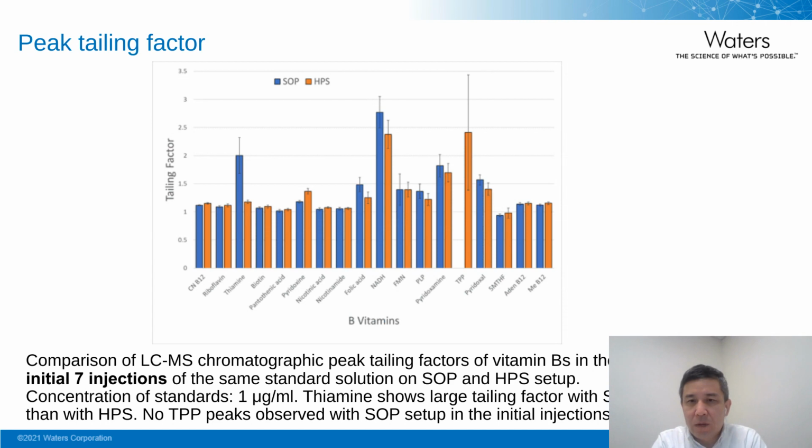Also, since for the TPP there's no peak observed with the SOP setup, there's no peak-tailing calculated for the TPP with the SOP setup.